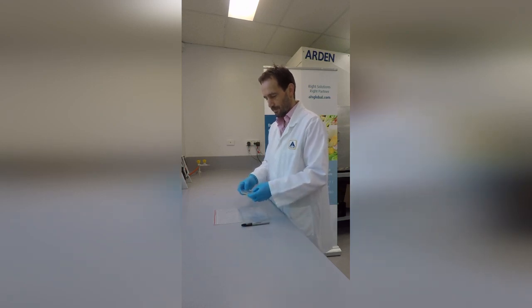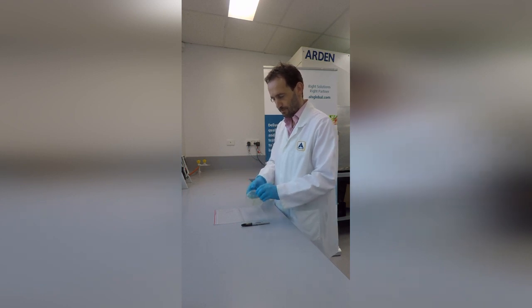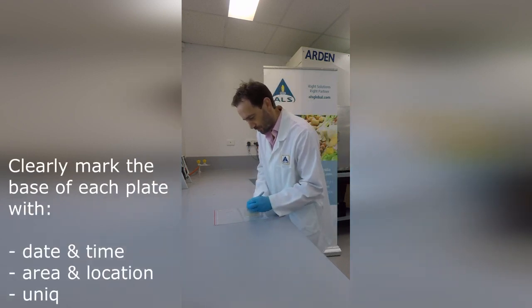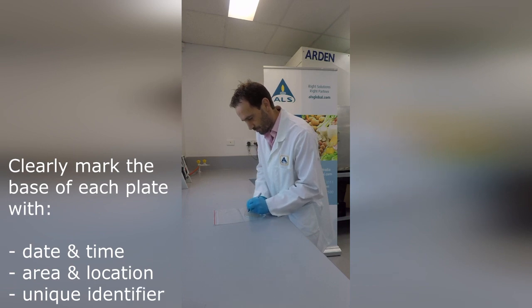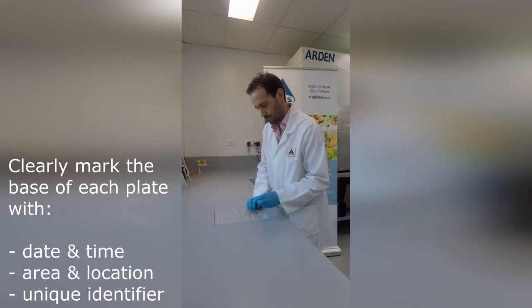Examine the plates for contamination prior to use. With the plates required, ensure the correct information is written on the base. Do not mark the lid of the plate, as this could be lost or placed back on the incorrect plate.